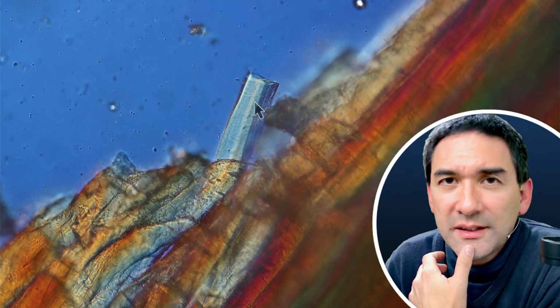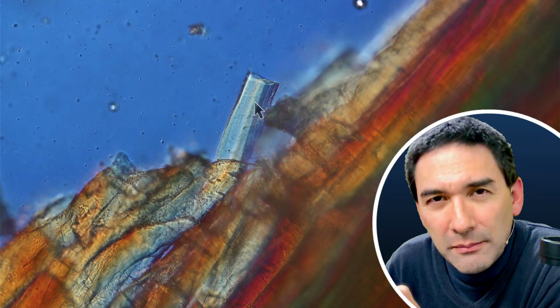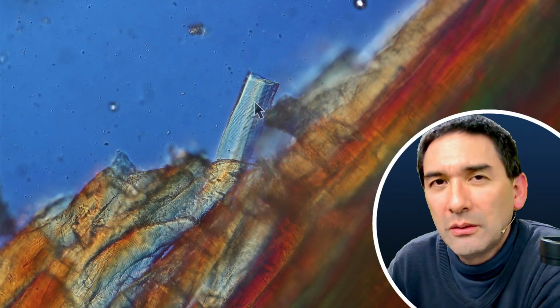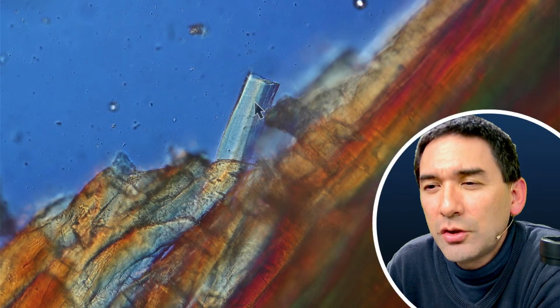I don't know if this has an advantage, because sometimes if the blade is a little bit moist, then this actually will help in cutting, right? Or maybe the ethanol does help in cutting a little bit. Yeah. Most likely it was already answered, but I just came back.